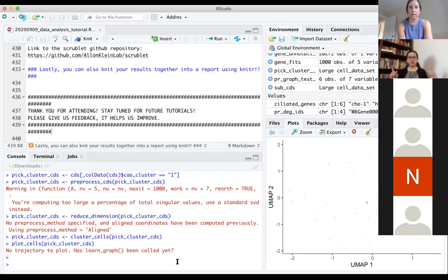Yeah, because when you plot the trajectory, you can have 4 different branches. So one of the ways of looking at it, if this kind of analysis is clearly right for your data, then you can subset out the different branches of the trajectory and then try to see if the variability is seen more clearly than when you look at it as a big chunk. And we can talk more offline if you want to talk more in detail.